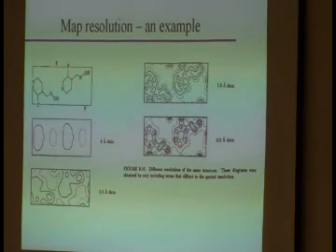There are 6 atoms very clearly, and one of them has more electron density than the other ones. It's your nitrogen. There's your fluorine. It has more electron density than this one. There's another nitrogen, once again, has about the same electron density as that one. The oxygen has a little more. That is a beautiful map. Okay, that is easy to work with.